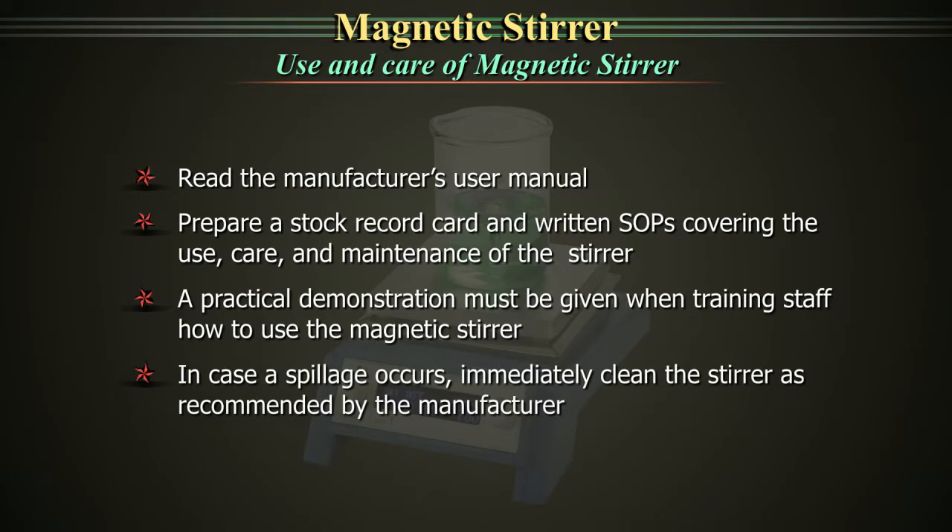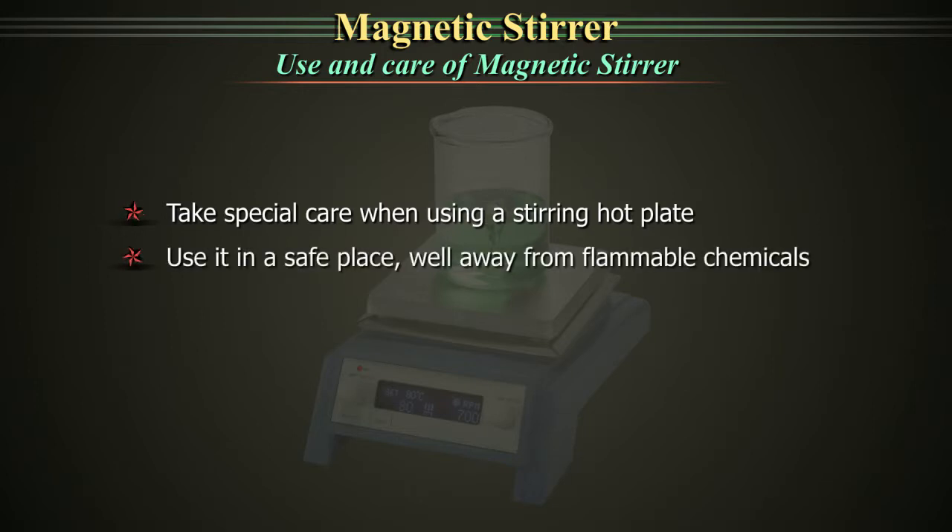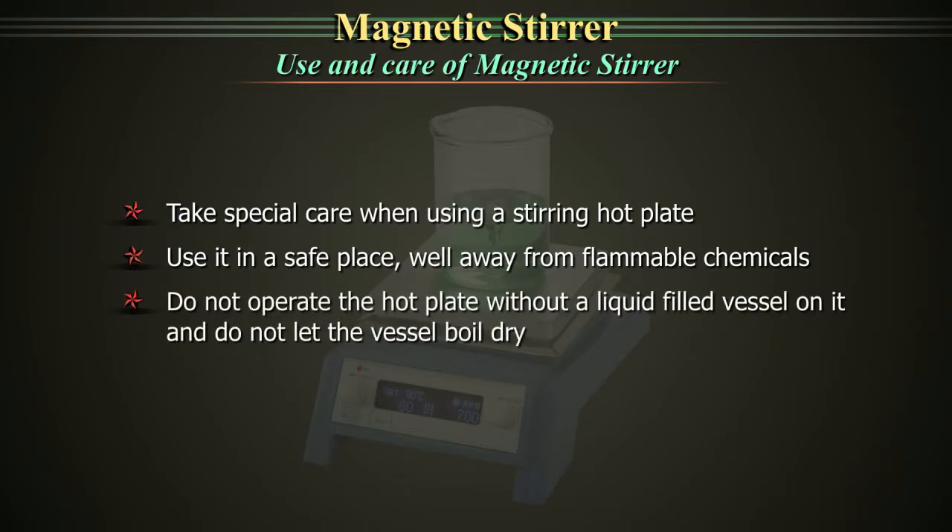In case a spillage occurs, immediately clean the stirrer as recommended by the manufacturer. Take special care when using a stirring hot plate. Use it in a safe place well away from flammable chemicals. Do not operate the hot plate without a liquid-filled vessel on it and do not let the vessel boil dry. Turn it off immediately after use.